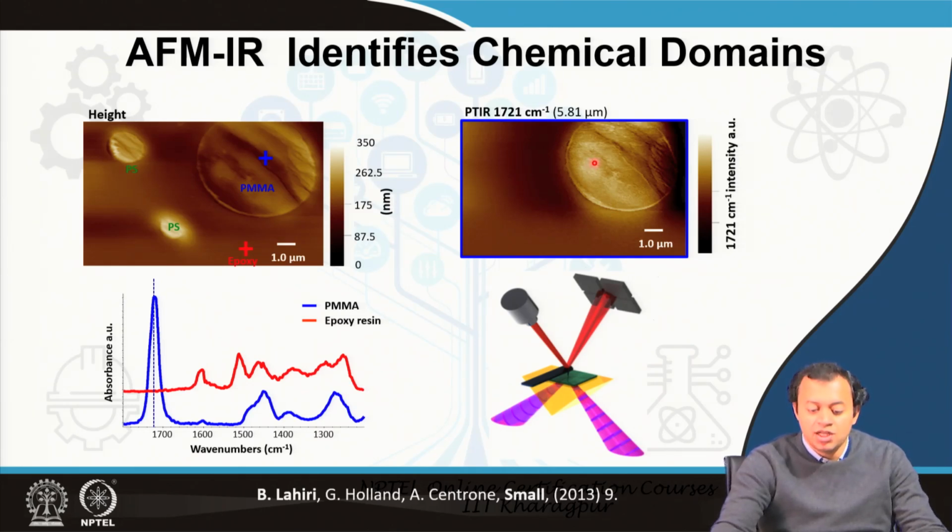This is a chemical image, this is a tip deflection image, where I am seeing here that the tip has not deflected at all in the Z direction. This black thing is the cantilever tip. Here the cantilever has deflected quite a lot. I am back calculating and reconstructing this image.